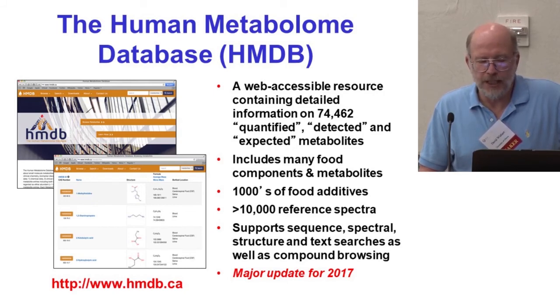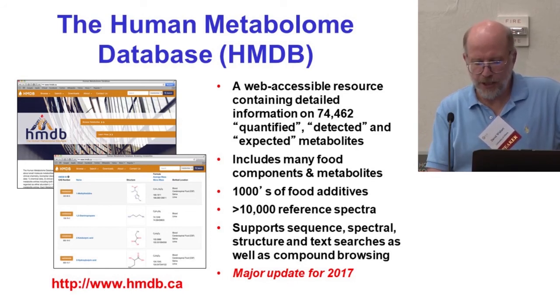It's designed very much like the food database. People can do spectral and structure searches, text searches, compound browsing. They can also search by sequences, DNA and protein sequences. There'll be a major update coming out in about 2 months, which will probably quadruple the size of the database.